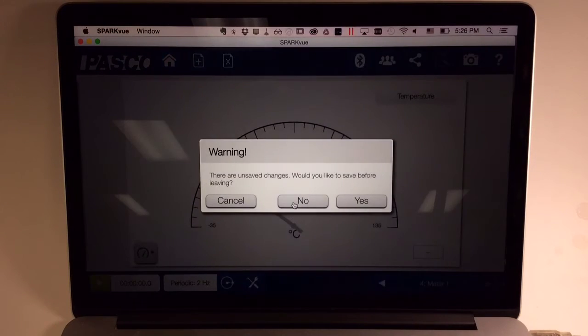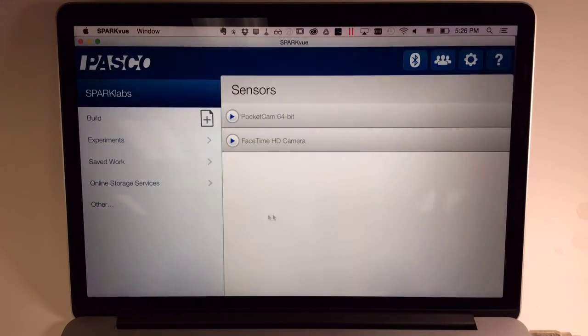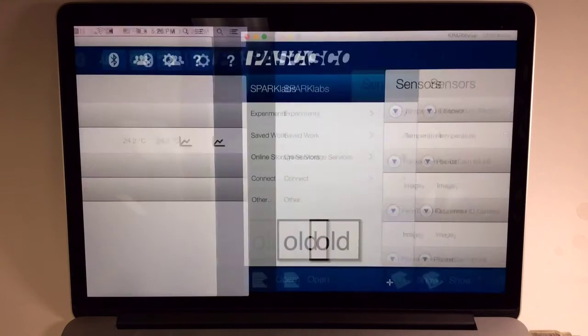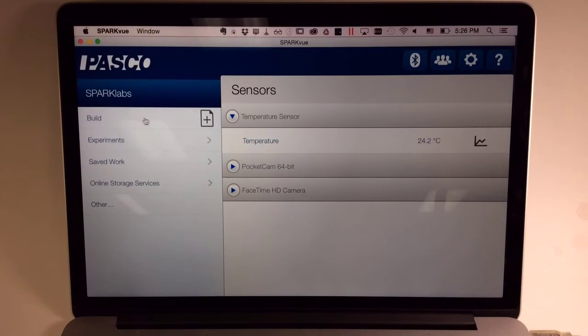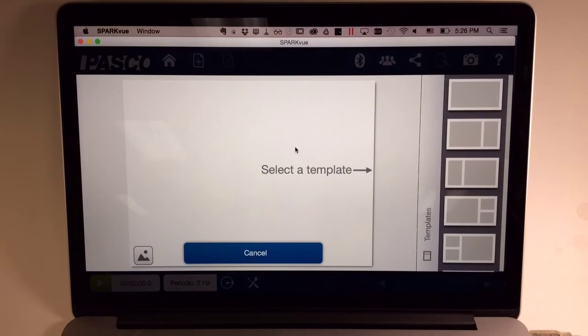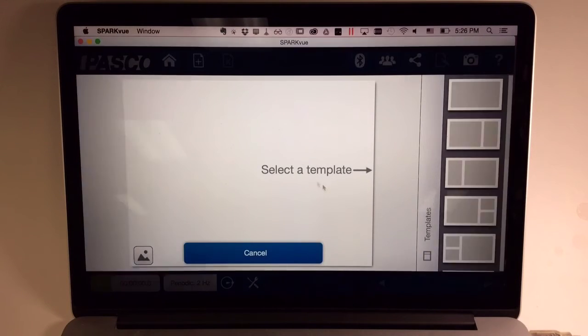I'll go back to the home screen. Finally, the Build button's capability is now at the top of the SparkLabs list. It functions pretty much as it did before, getting you to a Build screen where you can design your own page.